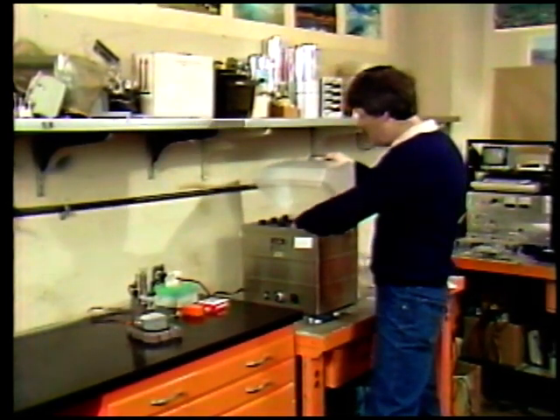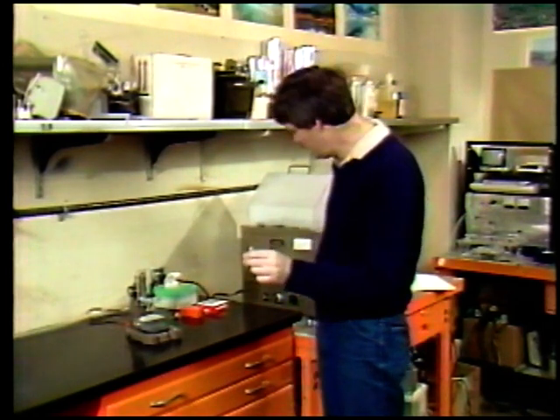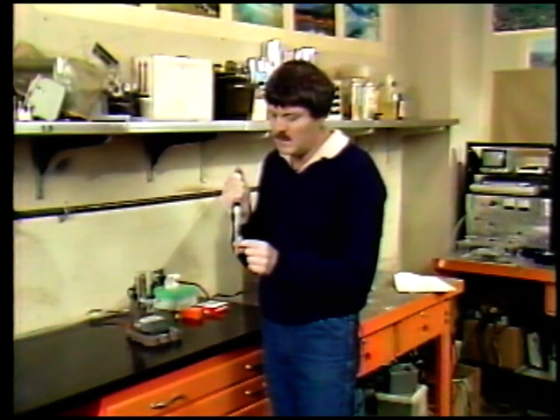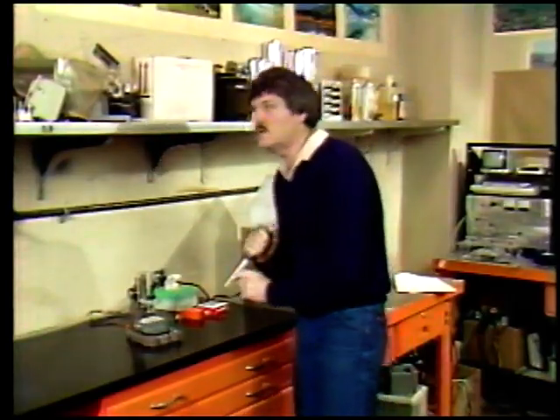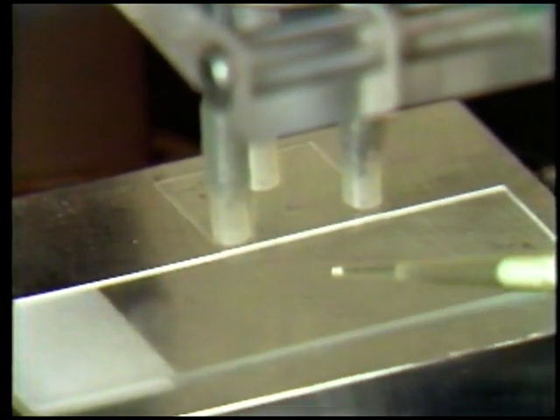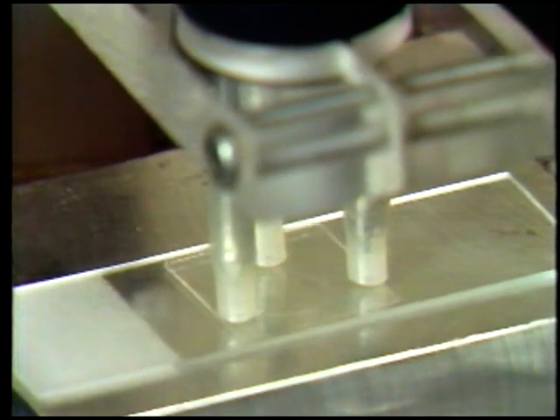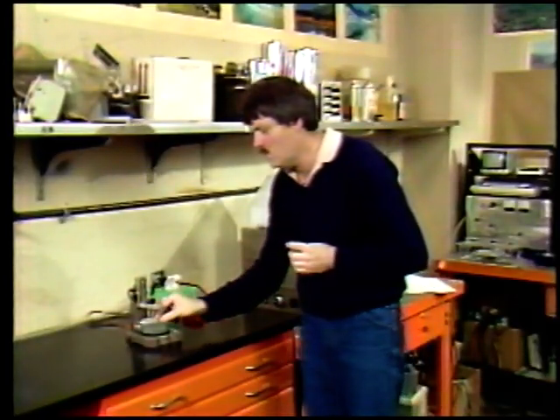Here in this heated water bath is a sample of melted agarose made with half-X TBE electrophoresis buffer, containing half a microgram per milliliter of ethidium bromide and 1 microgram per milliliter of long-chain DNA. In this case, it was a lambda-phage DNA. I'm now taking 10 microliters of that mixture and putting it on the slide and lowering the cover slip. Gently place the cover slip onto the slide and remove it from the heat.